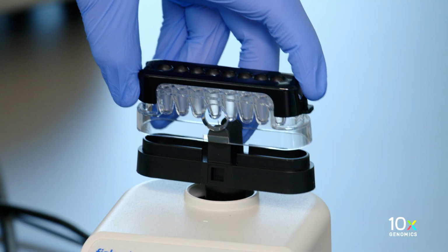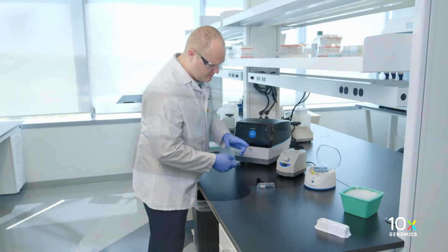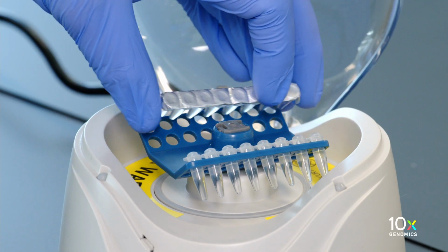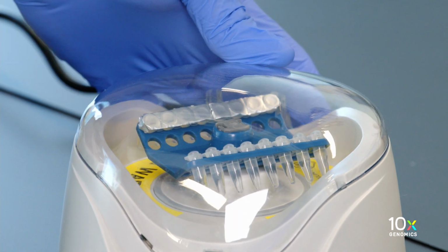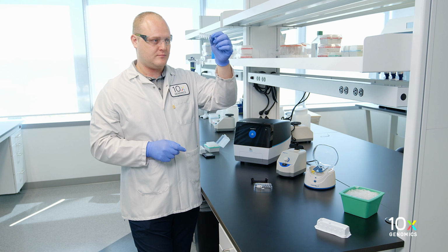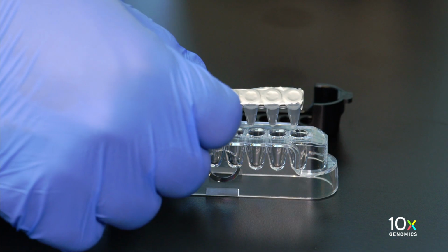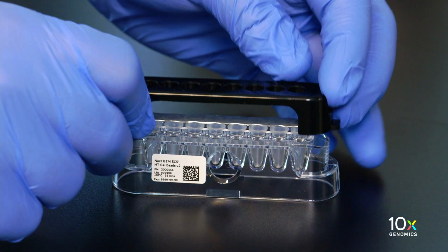Snap the tube strip holder with the gel bead strip into a 10x vortex adapter. Vortex for 30 seconds. Centrifuge the gel bead strip for approximately 5 seconds. Confirm there are no bubbles at the bottom of the tubes and the liquid levels are even. Place the gel bead strip back in the holder and secure the holder lid.